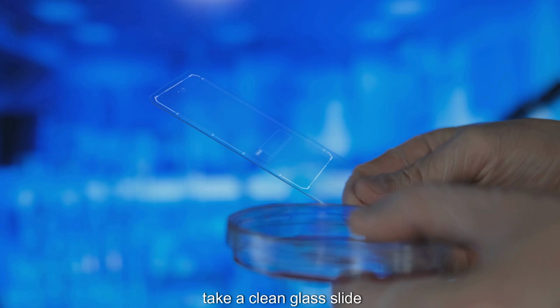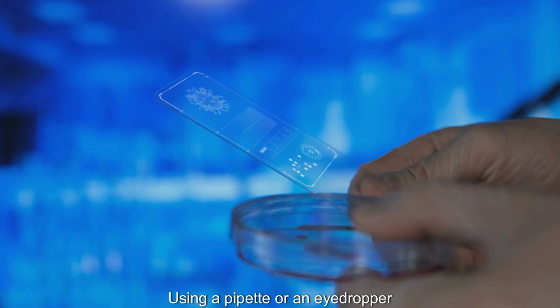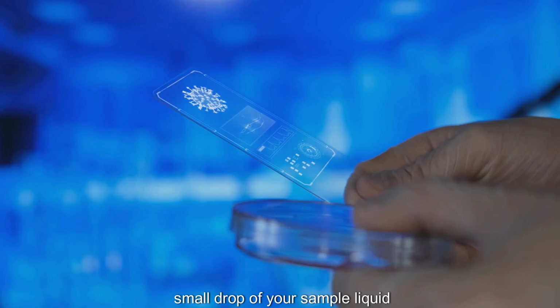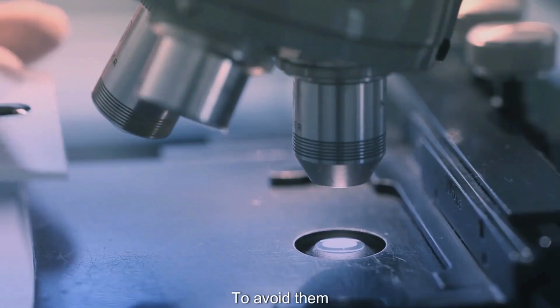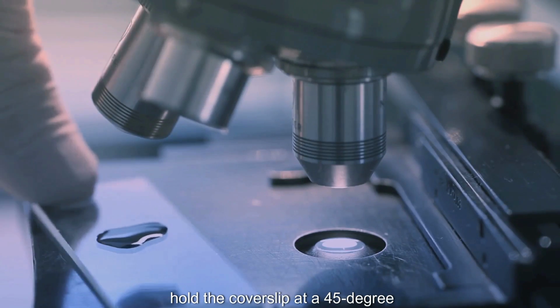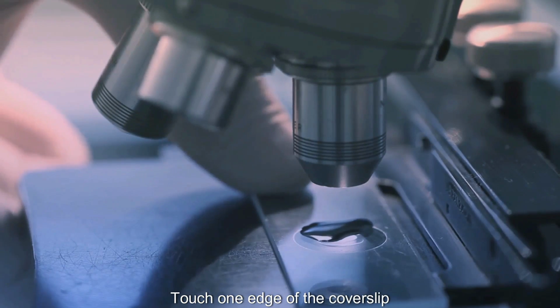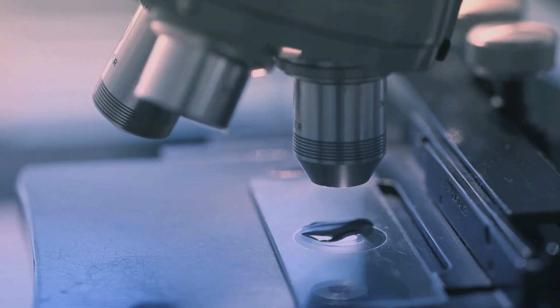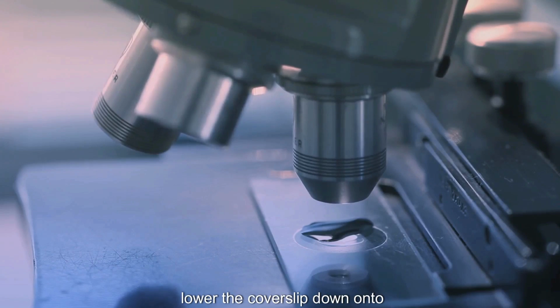To begin, take a clean glass slide. Using a pipette or an eyedropper, carefully place a single small drop of your sample liquid in the very center of the slide. To avoid air bubbles, hold the cover slip at a 45-degree angle to the slide. Touch one edge of the cover slip to the edge of the water droplet. Then, slowly and gently, lower the cover slip down onto the drop.